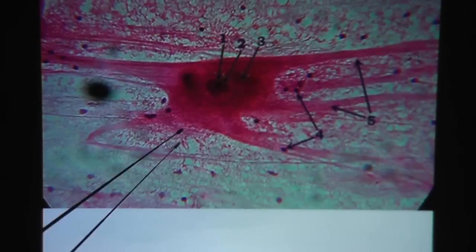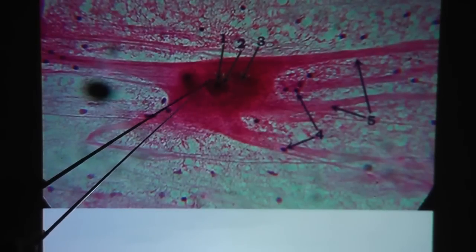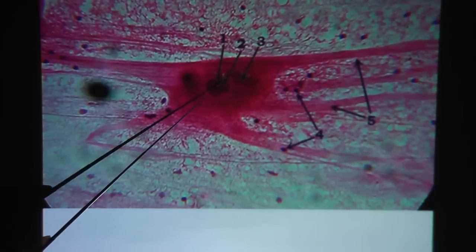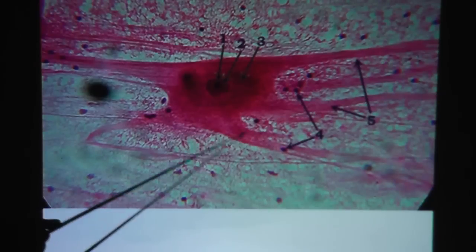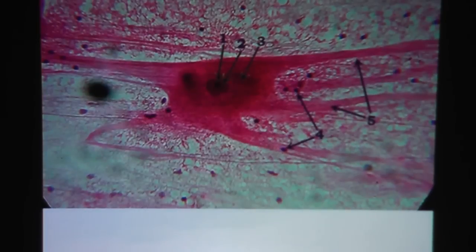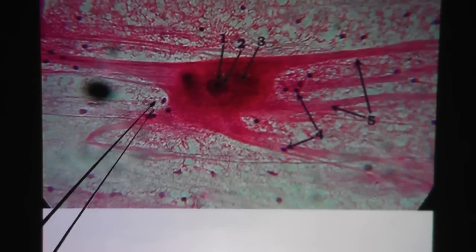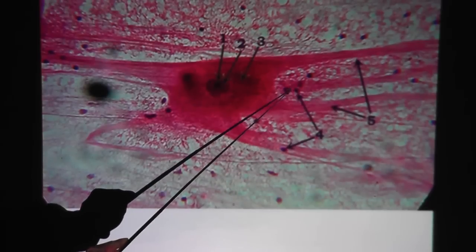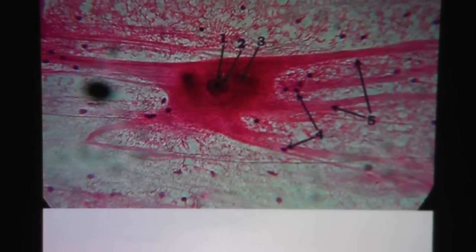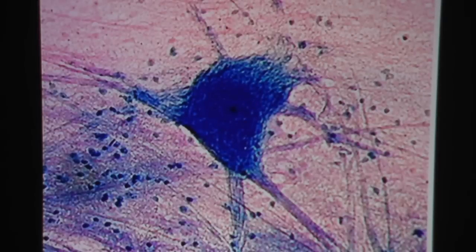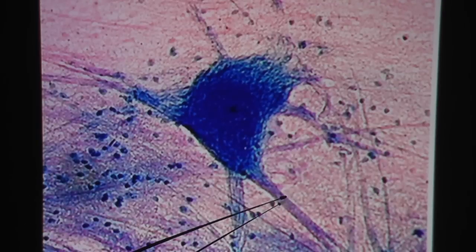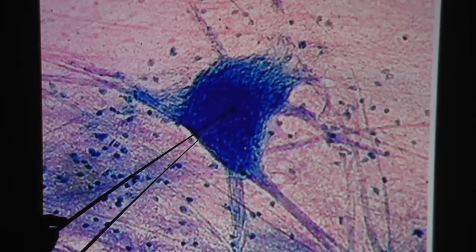Another look at a neuron. Here is the nucleus, and the dark dot inside the nucleus would be the nucleolus. Many processes — and because it got cut off, it's hard to say which one is the axon and which is the dendrite. Also, they're pointing to the dots of the neuroglial cells' nuclei. Another look at a neuron with neuroglial cells around it — notice these are processes that got cut off. You can see the nucleolus pretty clearly in the middle.